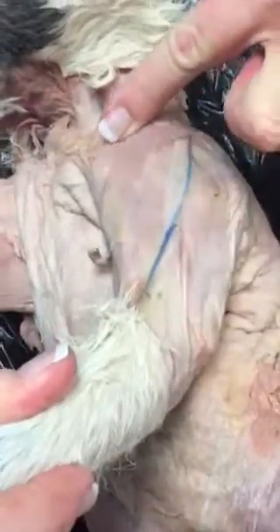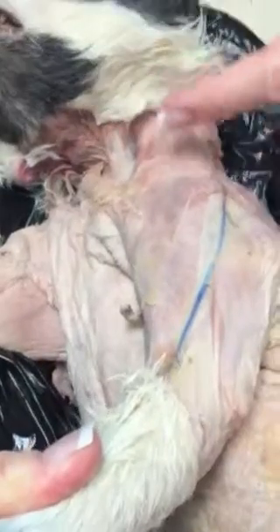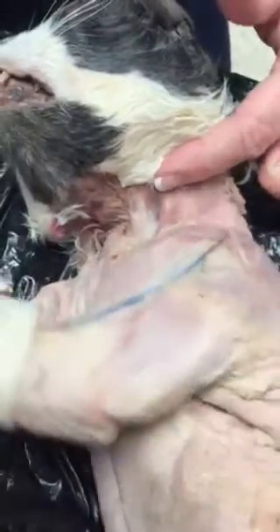When we look on the side, we have cleitobrachialis from this line down, and then we have cleitocephalicus from this line up. We also have the deltoideus, and then in this area we have the triceps brachii.